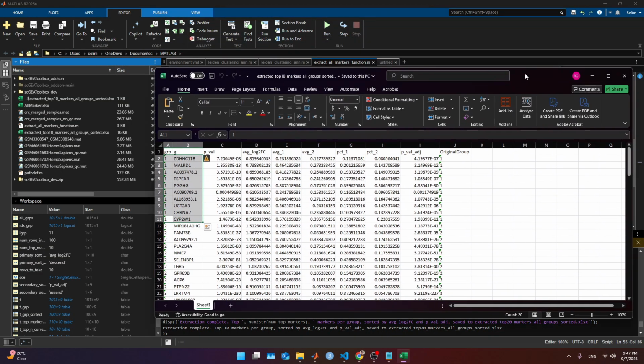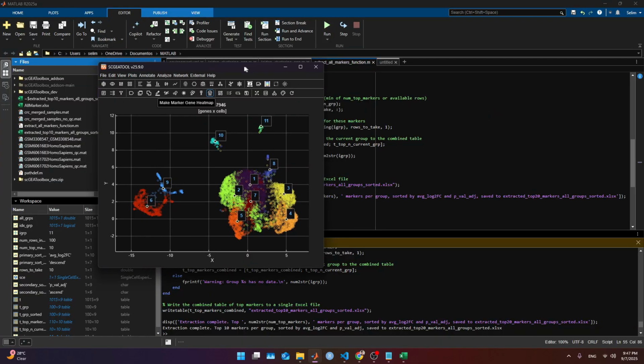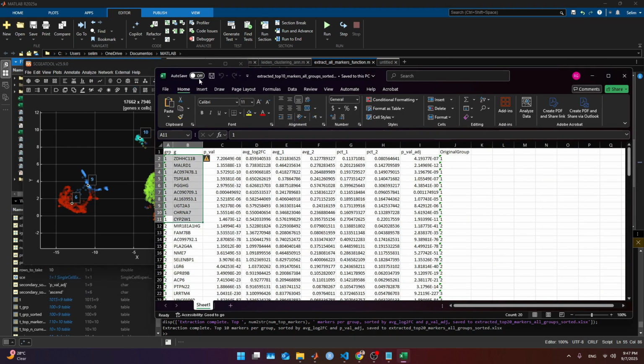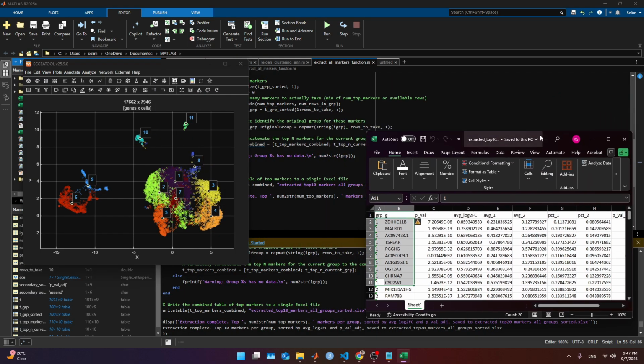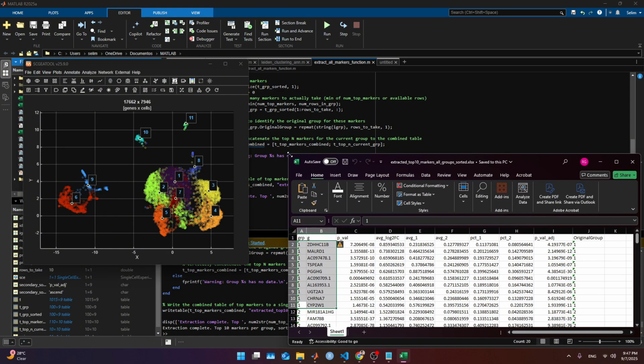So here we're gonna do something very interesting. One thing first, it's gonna be bringing this, the UMAP. Second, it's gonna be having this in the corner right here.